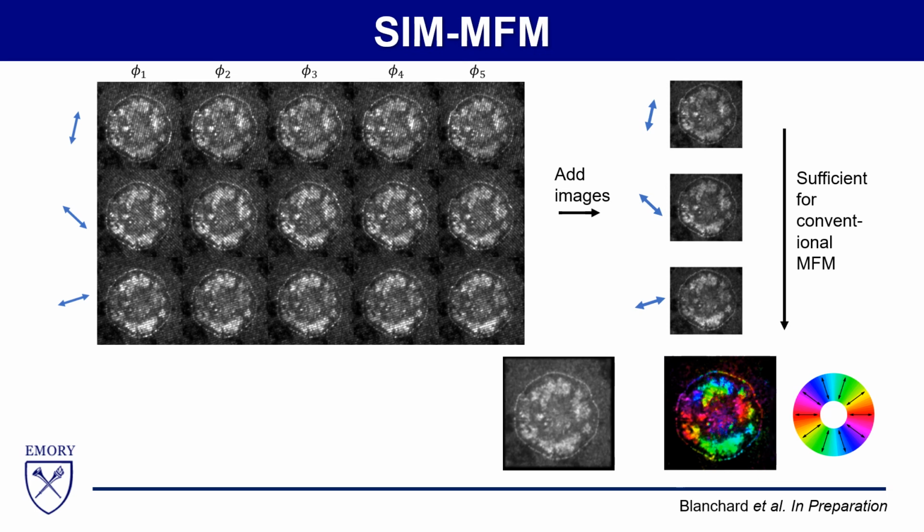That's what we expected, so this implementation of MFM on a SIM microscope appears to have been successful. This acquisition is roughly threefold faster than our previous implementation of SIM, as it can be completed in roughly 1.2 seconds.